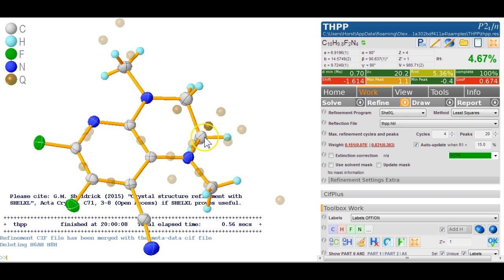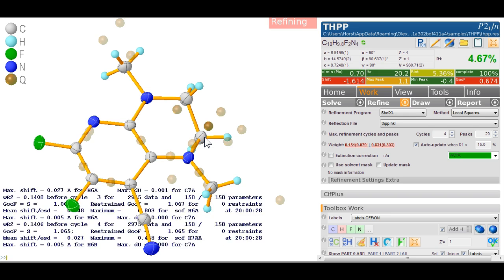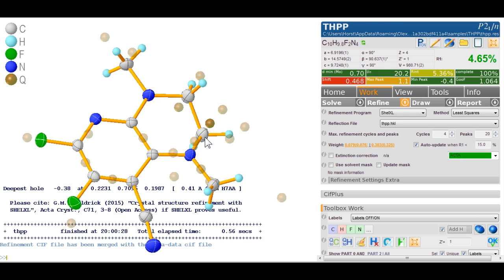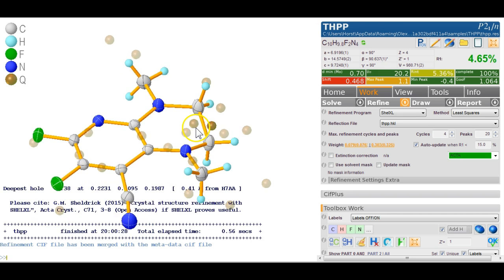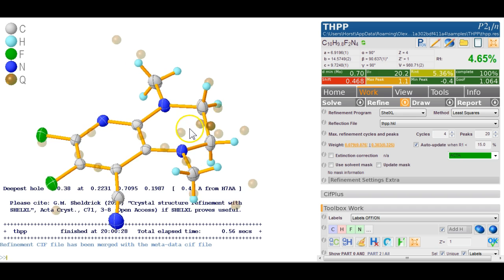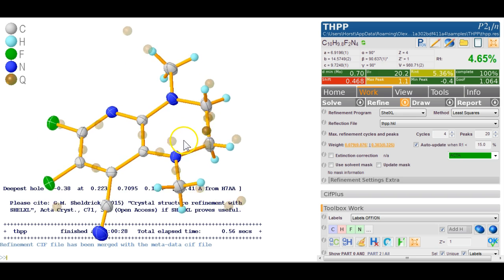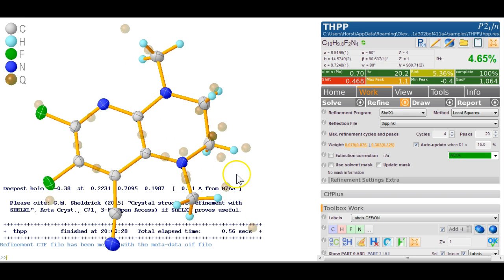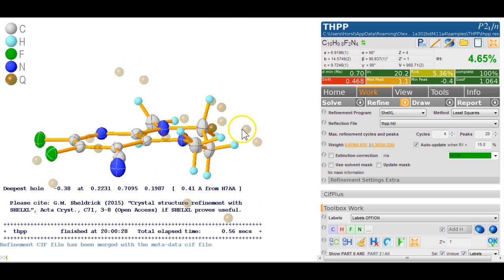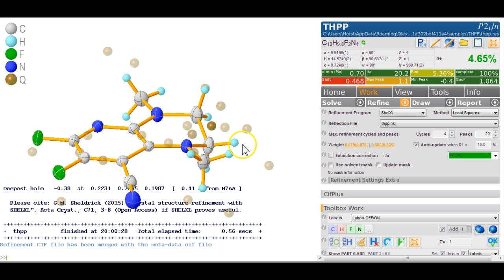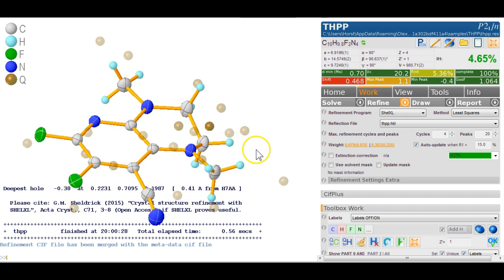And I think that's because we left the part in here so this is actually in part zero so I type part zero and I put this atom into part zero and now we are at the structure as it might have appeared and I think in fact this is how it was published.